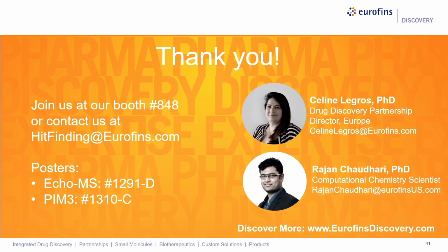I have one last question regarding your cascade. I see you have a counter screen. Does the biophysical or the mass spec activity-based assay take the place of the counter screen for the ADP-Glo assay? Oh, no, we didn't put any specific counter screen. As we have several different readouts to confirm the activity, we basically made the economy of the interference assay, depending on the readout you got. With ADP-Glo, the number of false positives is quite limited, and we use the other readouts. Mass spec is label-free, so you don't have this kind of interference with fluorescence and luminescence. So that was a win-win situation. As much as possible, if we can manage to get an orthogonal assay that avoids a purely technical counter screen, we try to have it. But it's really dependent on the readout.